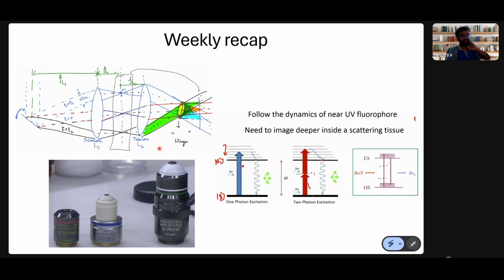As we all know, the main aim of this course is to understand how optical spectroscopy works, and how we use optical excitation and emission phenomena in instruments which can image biological phenomena, specifically a microscope, and how we can construct different kinds of microscopes to image whatever biological specimens we have in hand.